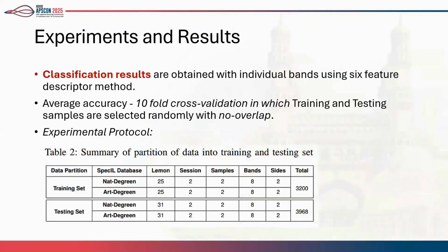For experimental analysis, the idea is to do the classification based on the individual band performance across each of these 6 feature extraction methods.